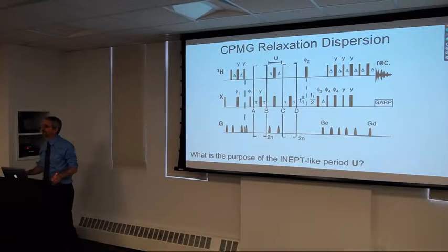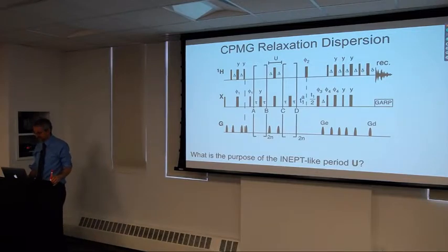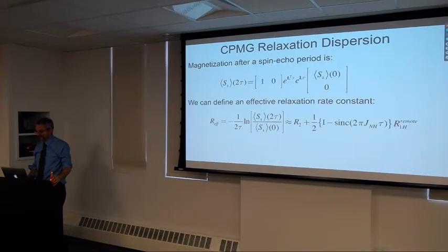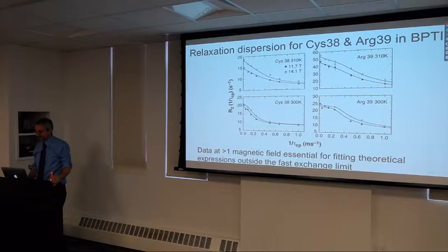Hans? So, can you go one slide back? So on the CPMG curve. With the CPMG curve, where you show that. Yes, right. So you pointed out that at small tau CP, so to the right, that's hard because it gets too short at some point. And large tau CP are difficult maybe because the protein is large, relaxed for a long time.